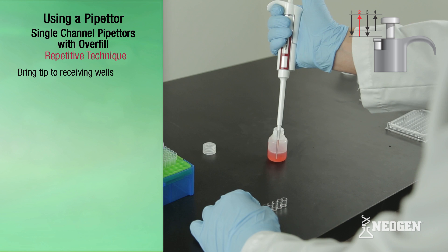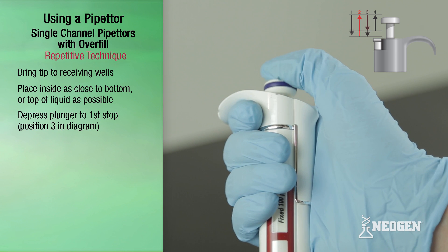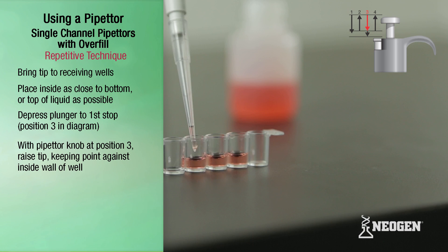Bring the pipetter with the filled tip to the receiving well and place the tip against the inside wall of the receiving well as close to the bottom, or as close to the top of any existing liquid in the well, as possible. Slowly depress the plunger to the first stop — position three — to dispense. While holding the plunger knob at position three, slowly raise the pipetter, keeping the point of the tip against the inside wall of the well. This is known as dragging the tip after dispensing.